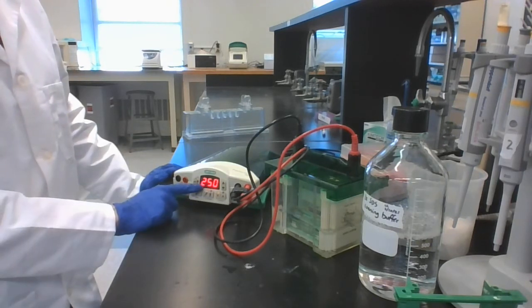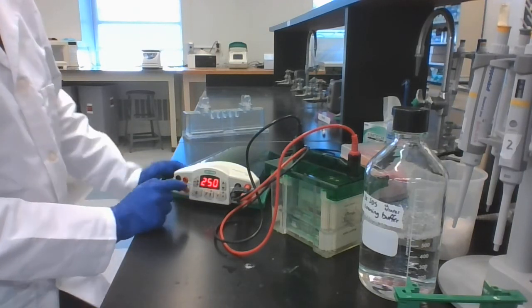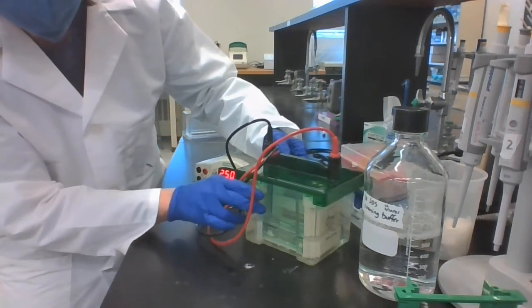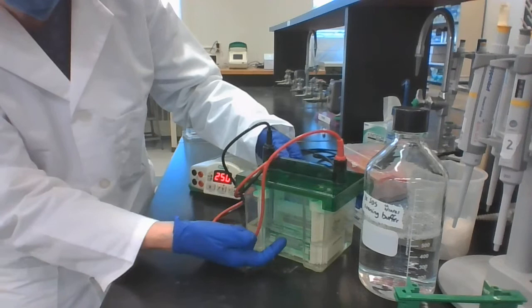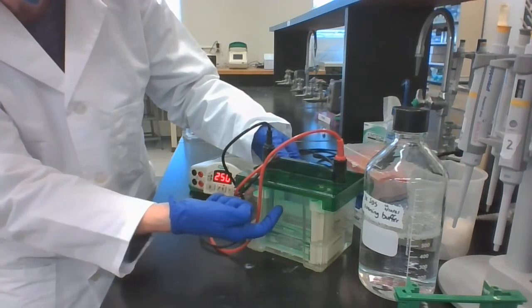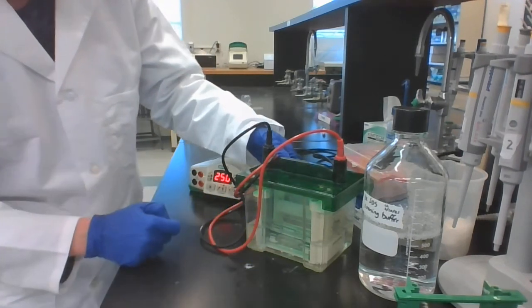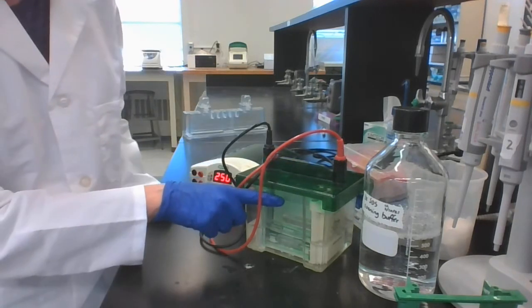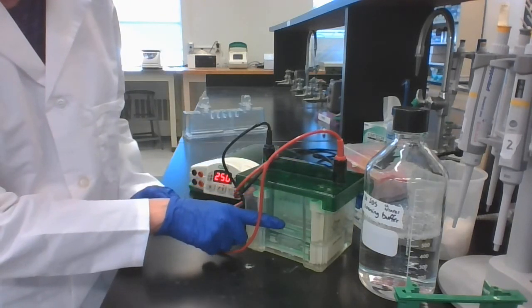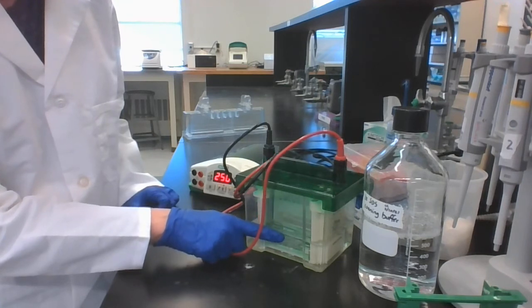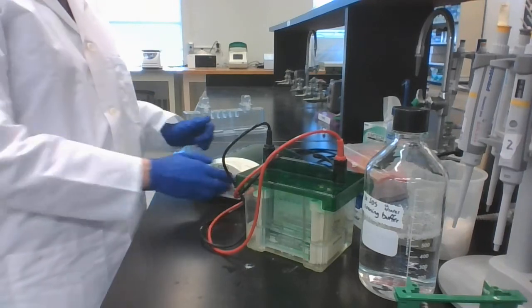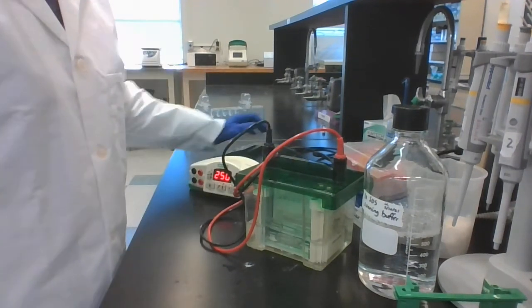And then this is the readout of how many volts they're on. As it's running, you should be able to see little bubbles coming up from the bottom into the middle buffer. And that's an indication that the current is flowing correctly. You'll be able to watch as the blue dye goes down, and then you'll want to stop it before it reaches the bottom of your glass plate.